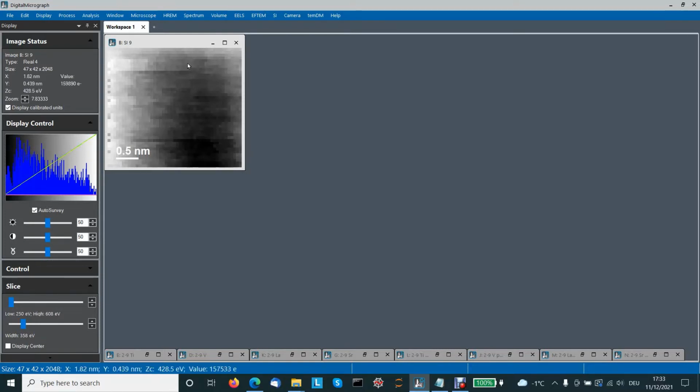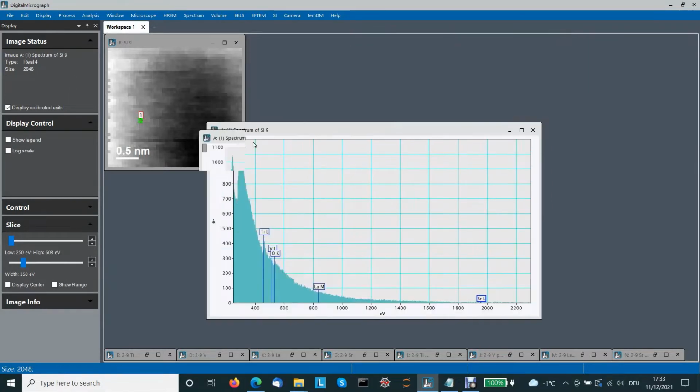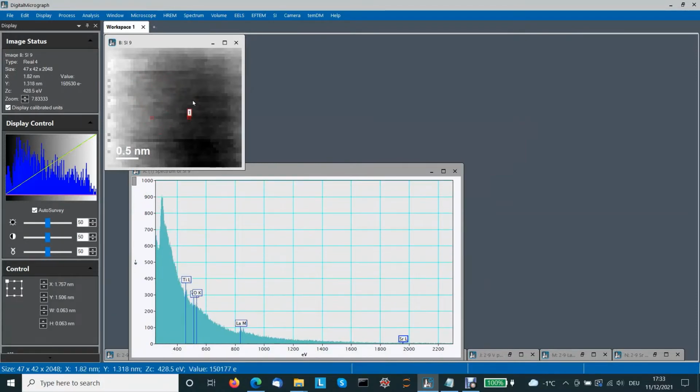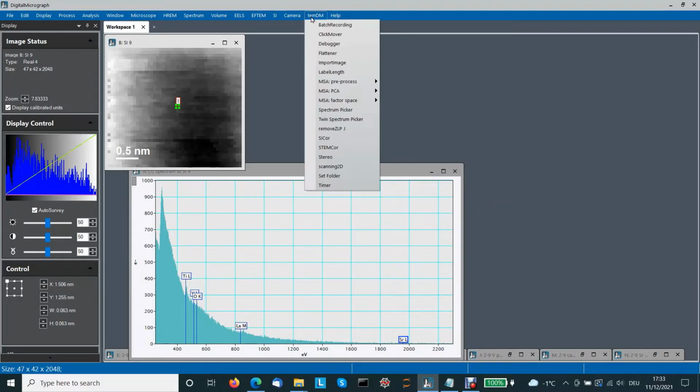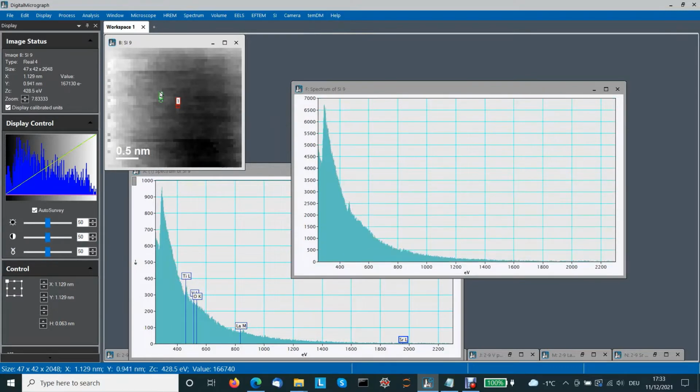Well, let's take some spectrum image, for instance this, and you can look at spectra with the Gatan tool, this one. We can scroll over the spectrum image and see the spectrum. temDM MSA also allows you to pick spectrum. Just choose spectrum picker. It would be another green colored marker, but basically it acts the same way.